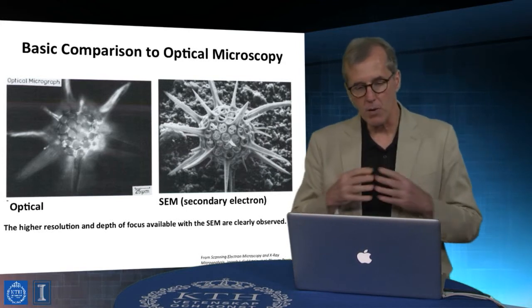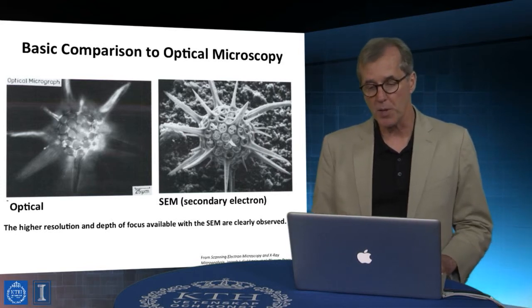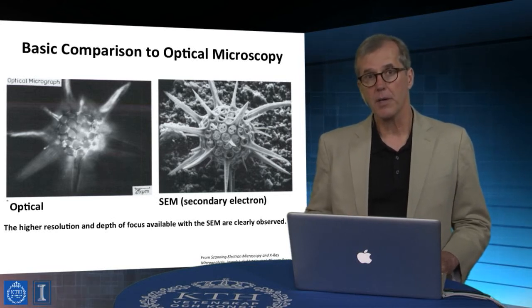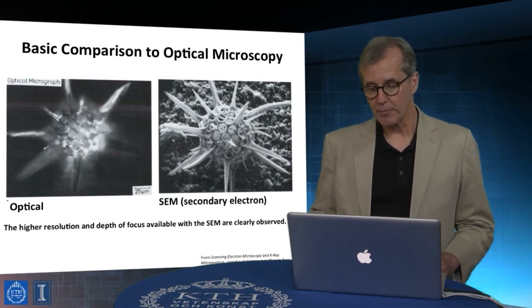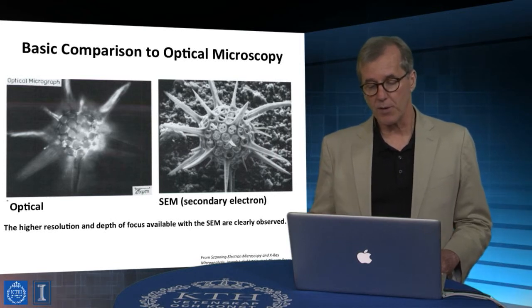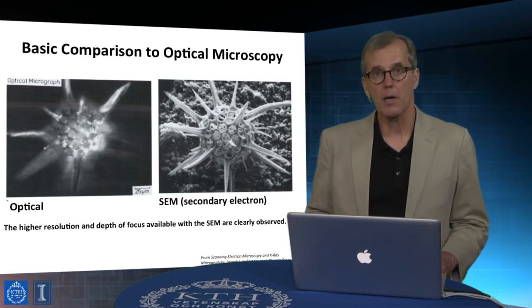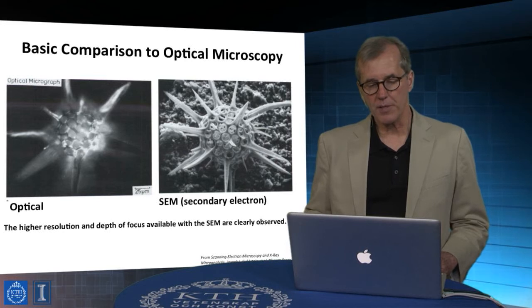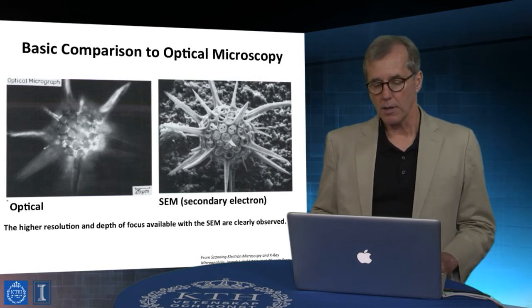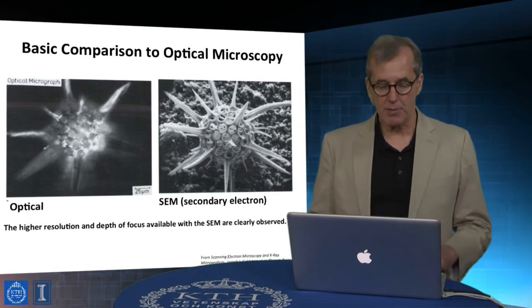It's useful to compare electron microscopy to other forms of microscopy, in particular microscopy used with light. We know first and foremost, because of the difference of the wavelengths involved, but mostly because of the beam diameters involved, the spatial precision of an electron microscope can in fact be very high compared to optical microscopy. But the other part of it is that because of the way the optics work, it has remarkably enabling attributes with regard to field and depth of view.